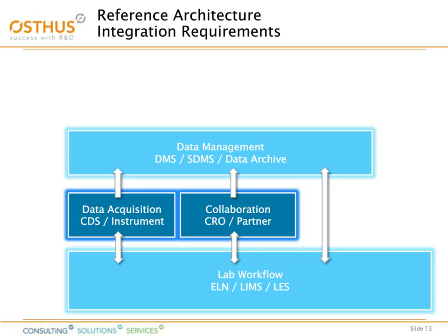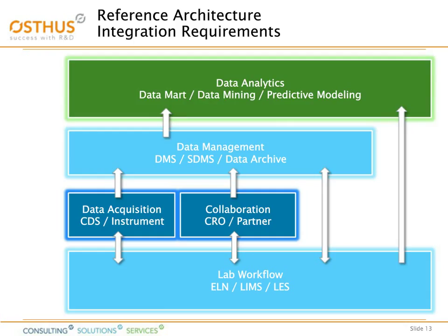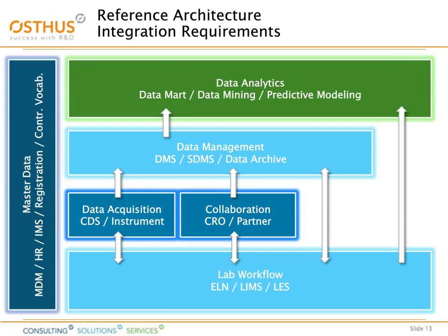Information from both these areas feeds into your data analytics. If you want to do a good data analytics like data mining or data modeling, you will need information both from those files you store and also from your lab workflow. And the glue that holds everything together is actually the master data. Master data helps you to combine this.